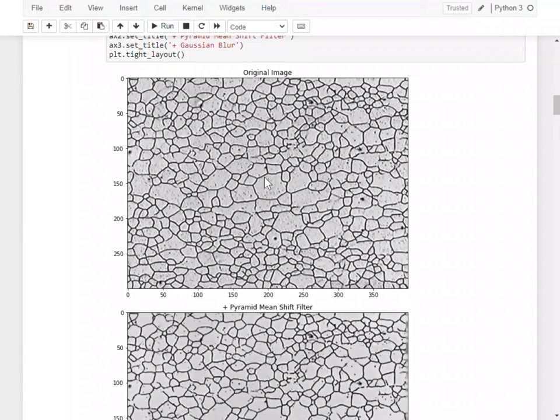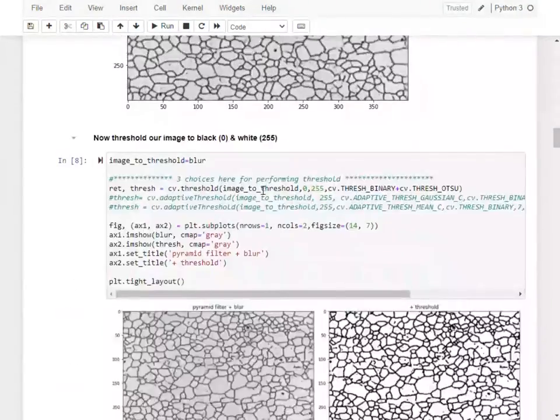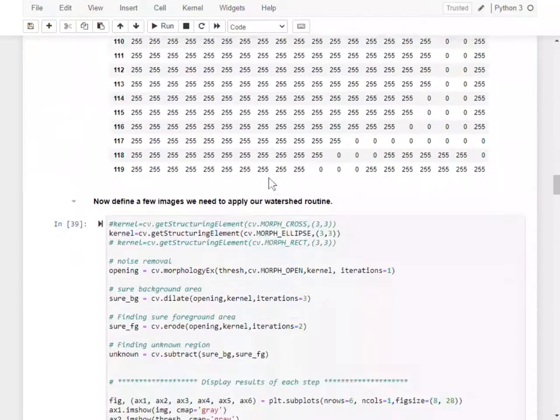I'm going to need to flip things a little so that these boundaries are actually white, because that represents a high height, and these regions are low. So as I fill up this grain, eventually it will get to this boundary, which is like a mountain that will contain the water as this keeps getting filled up more and more. All right, that's kind of the idea, and the computer will just keep track of that.